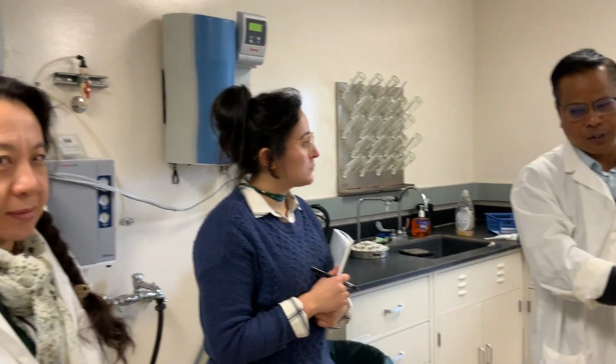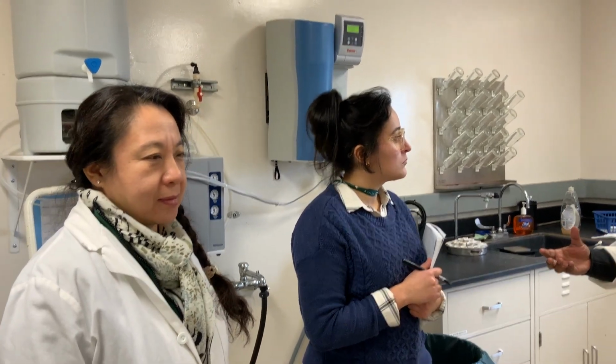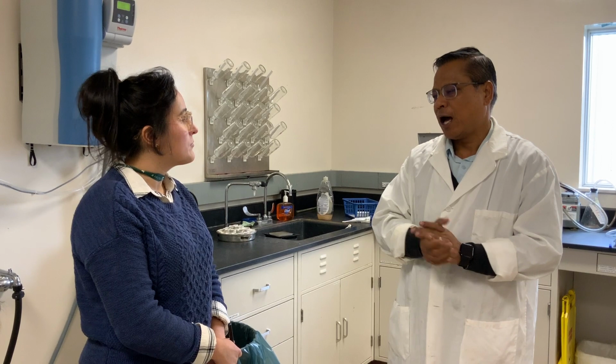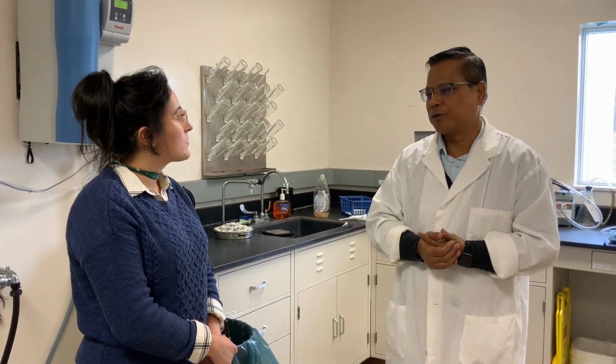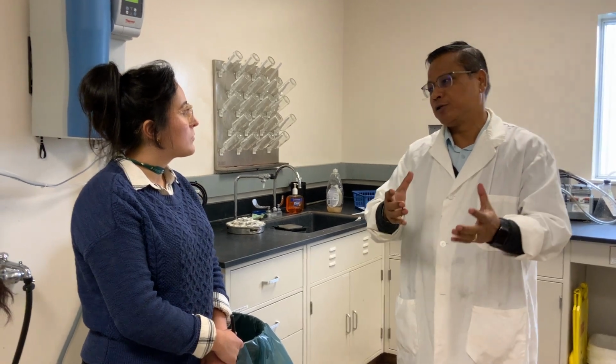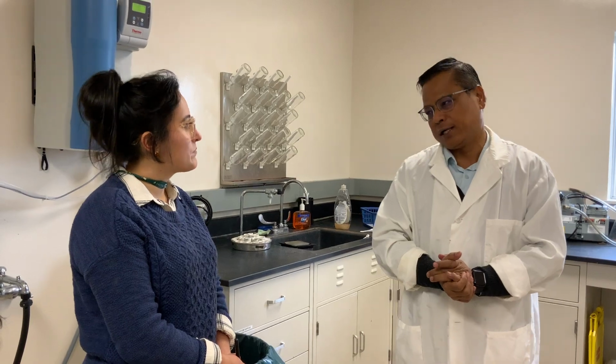What is the spectral characteristic or spectral signature of the waste before it is treated, and how could we differentiate it, not by seeing the turbidity or doing any gravimetric method, but rather by checking online through their spectral characteristics. So it is a non-destructive online kind of water surveillance system: how efficiently your wastewater treatment plant is working, or how efficiently your cleaning is being done.